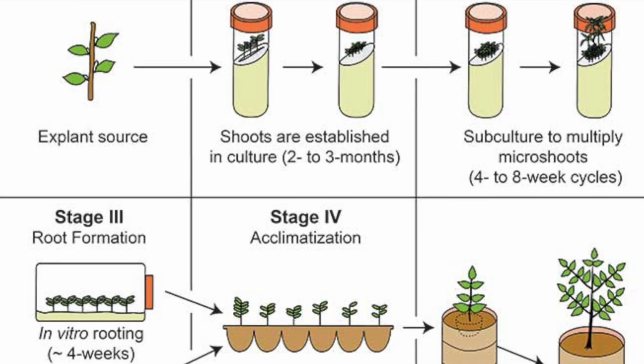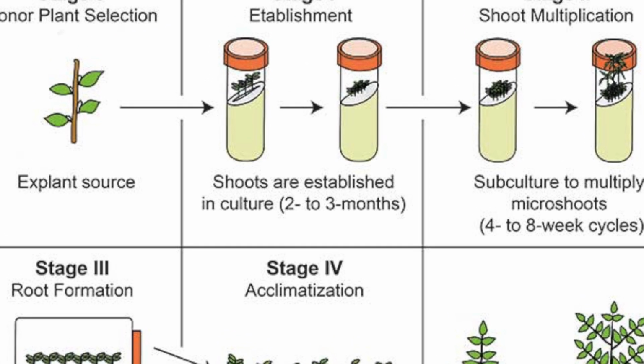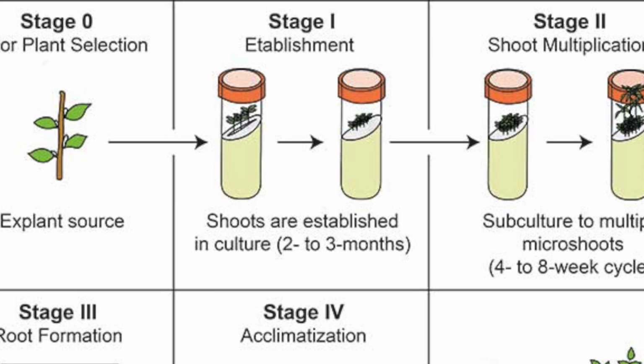Alright guys, moving right along to stage 1. So now, stage 1 is the second stage, but people overlook stage 0. Anyways, stage 1 is the next step after stage 0, right? And in stage 1, you are going to be focusing on 3 things: surface sterilization, cutting your plant material to the right size or the right parts of the plant that you want to use, and 3, putting your plants into nutrient-rich agar in an aseptic vessel.